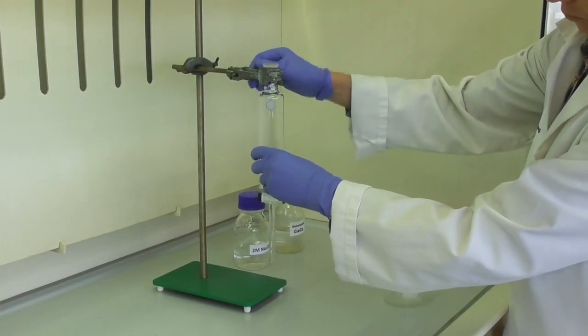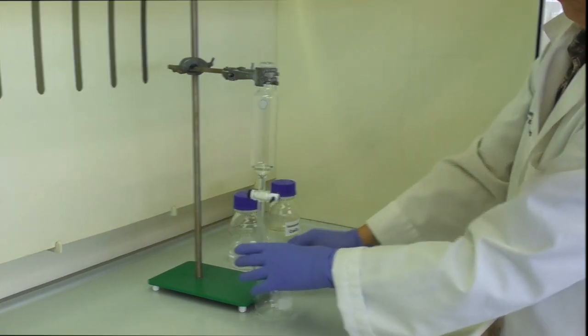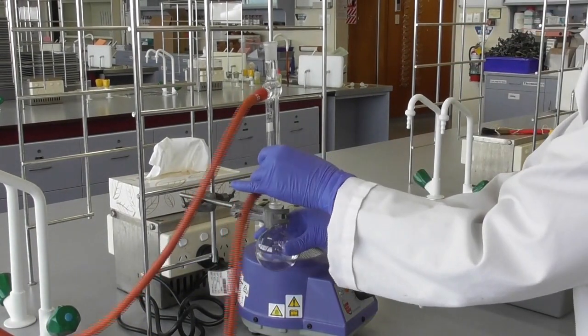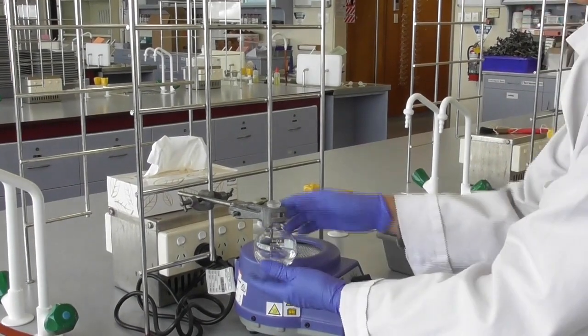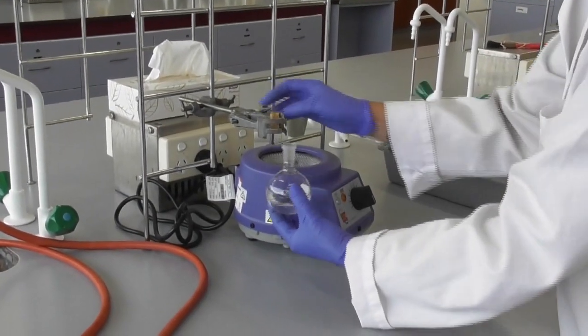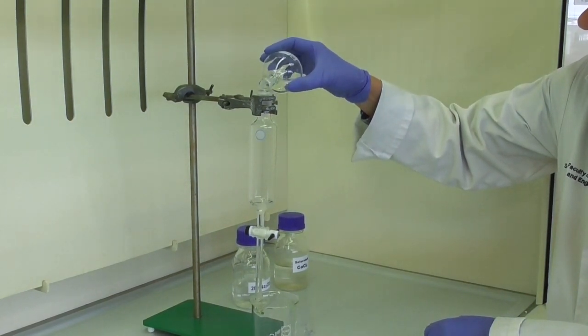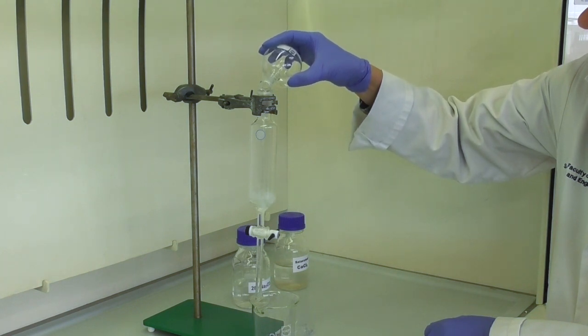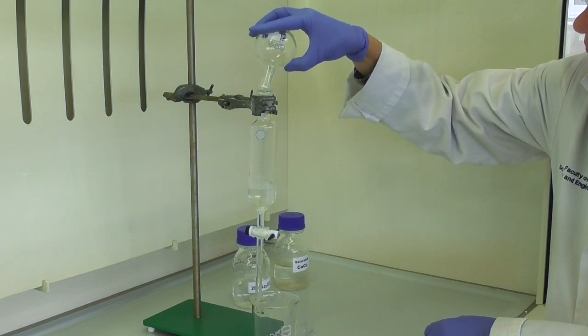In the meantime, we set up a separating funnel in the fume hood. Once the solution has cooled off, we remove the condenser from the flask and take the flask to the fume hood where we pour the solution into our separating funnel. It's a good idea to have a beaker underneath just in case there is leakage or spillage.